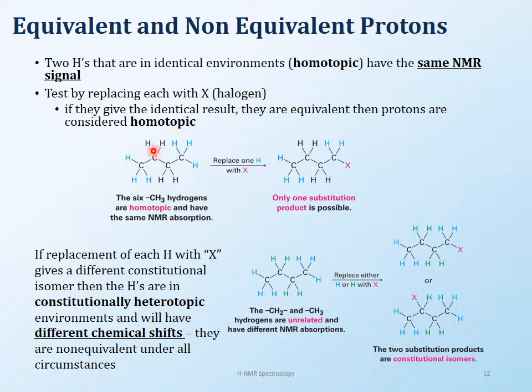When you look at this compound, you can see that you have two different kinds of protons in here. You have the CH3 and this CH3, and then you have the CH2 and the CH2. So again, going back to our symmetry days, if you slice this in the middle, you can fold this compound on itself. And once you can fold it on itself, then you know you have symmetry in there. And once there is symmetry, it means that these two protons are going to be the same on these two carbons. Now remember, in the proton NMR, you're not seeing carbons. You're only looking at hydrogen signals. You're not looking at carbons, you're not looking at halogens, nothing, just hydrogens.